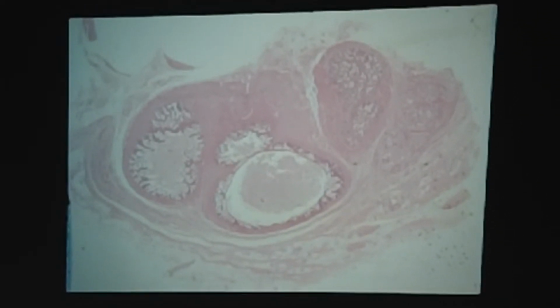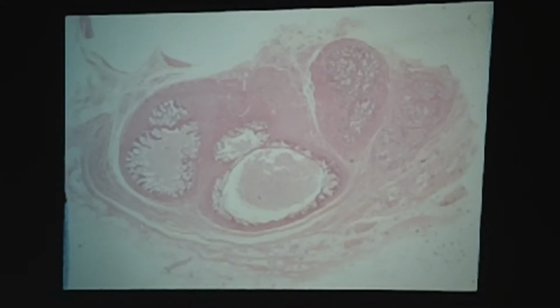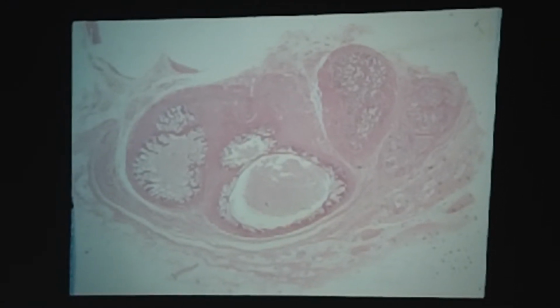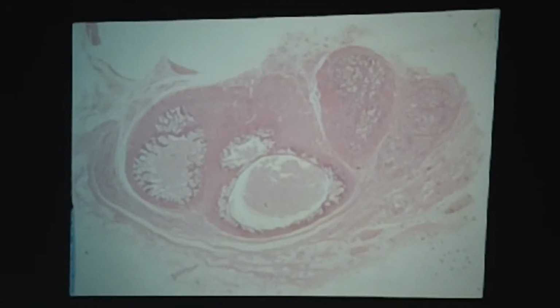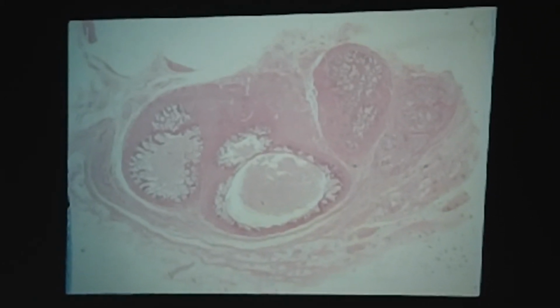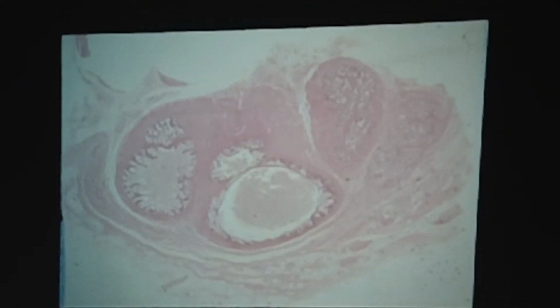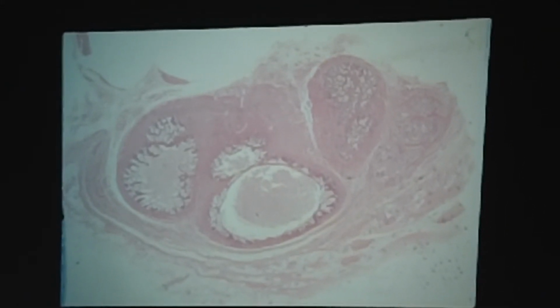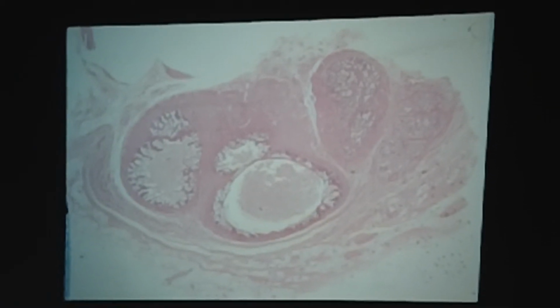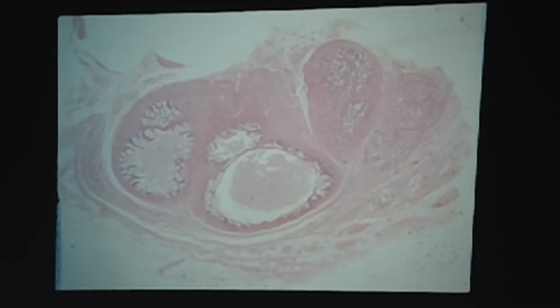Here, if you think you're looking at oviduct, what are you going to be looking for on the epithelium? Cilia, ciliated cells, simple columnar. But what about those peg cells? Those dark, non-ciliated cells that are interspersed? So if you look at an image like that and you think, it could be oviduct, could be seminal vesicle, go to high power and try to find peg cells. If you see peg cells, you got to think oviduct and forget seminal vesicle.